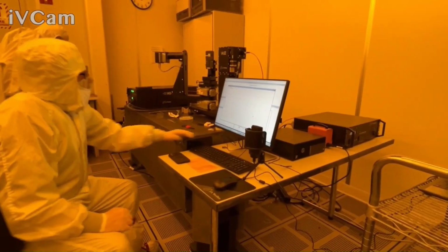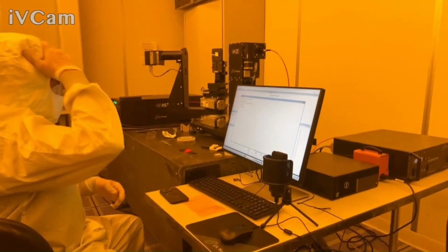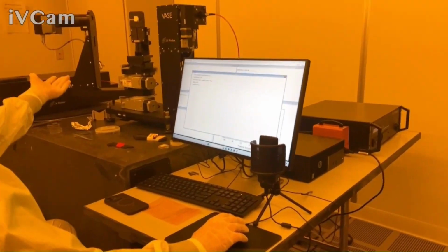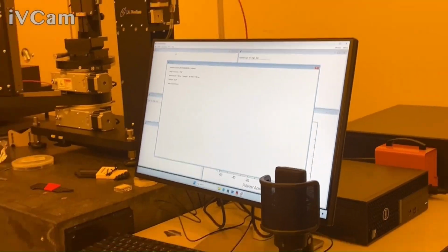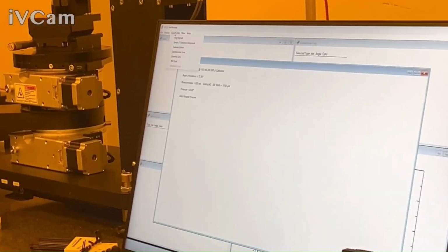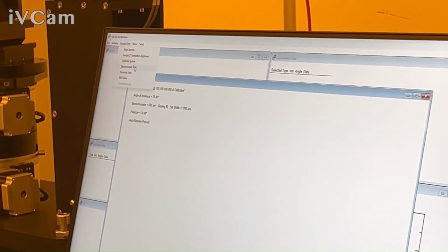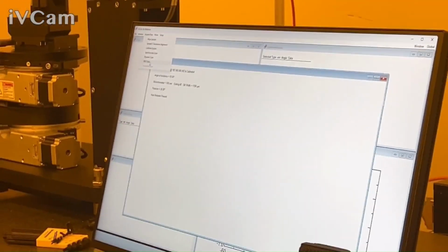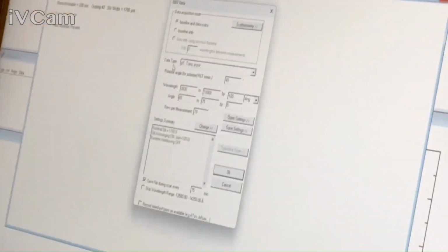So hit escape. In general, if we're gonna do ellipsometry, we're good to go. Take your measurement, do what we need. If we're gonna do reflection intensity, essentially that's gonna be acquired data, R&T data, instead of spectroscopic scan. So spectroscopic scan is your ellipsometry, R&T data is R&T.